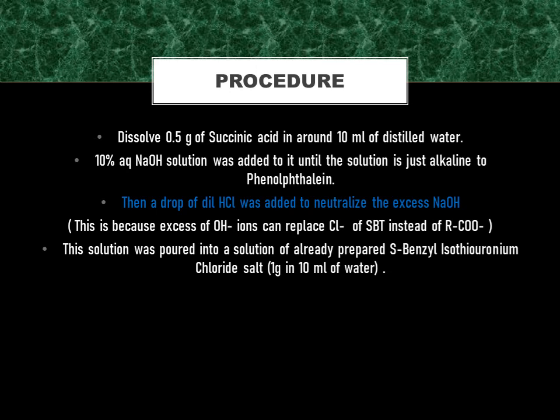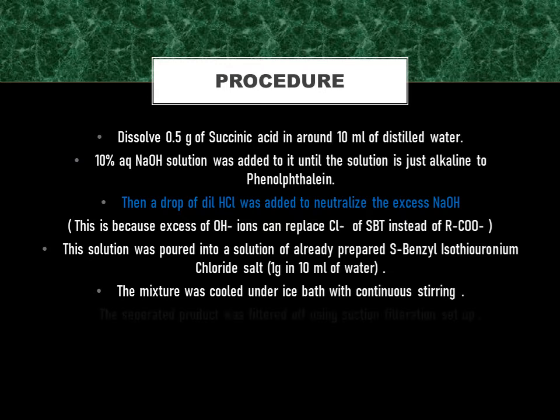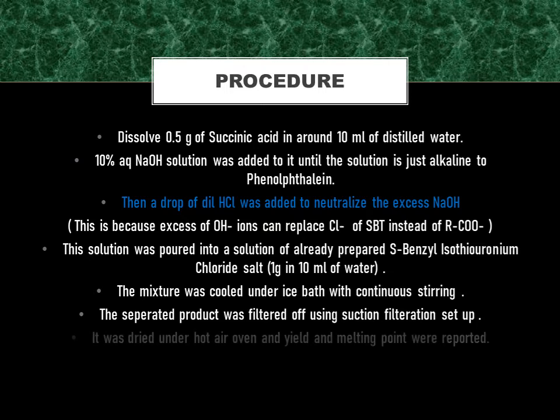Then, this solution was poured into a solution of already prepared S-benzyl isothiouronium chloride salt — 1 gram in 10 ml of water. The mixture was cooled under an ice bath with continuous stirring. The separated product was filtered off using a suction filtration setup. It was dried under a hot air oven. And finally, yield and melting point were reported.